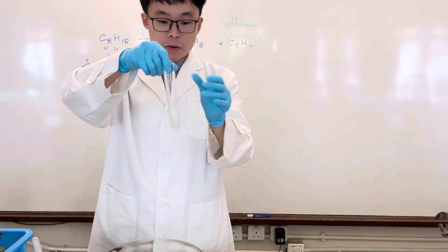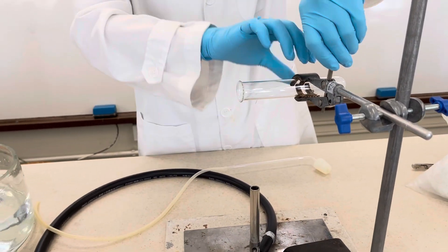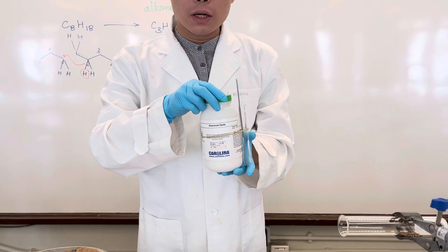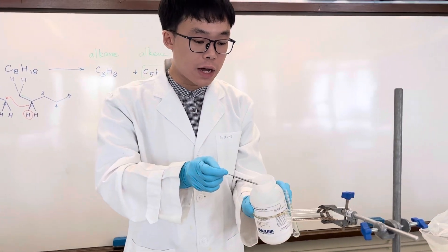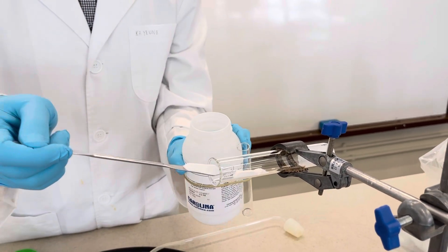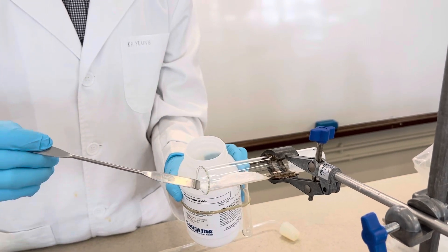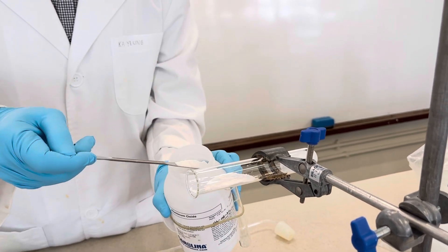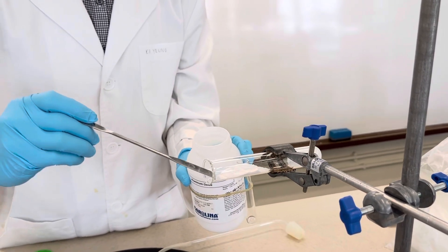Now we are going to put it onto the stand and clamp it in position. I have a bottle of aluminium oxide powder serving as the catalyst for this reaction, and we are going to add the aluminium oxide powder to the boiling tube. That should be good enough.